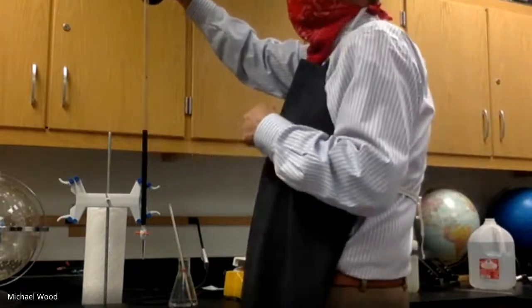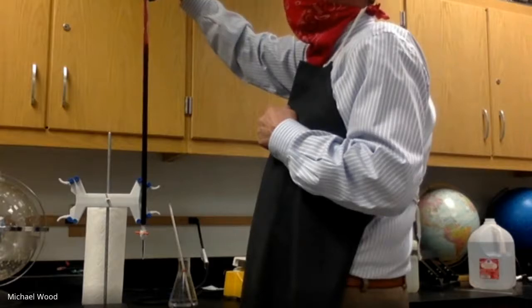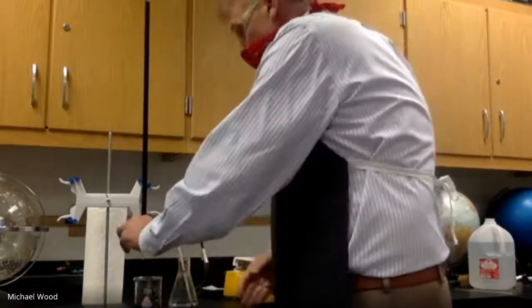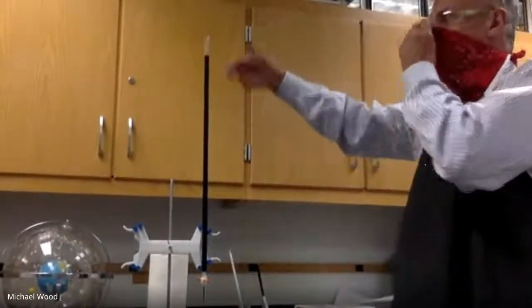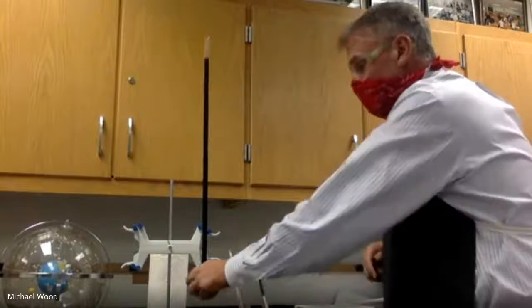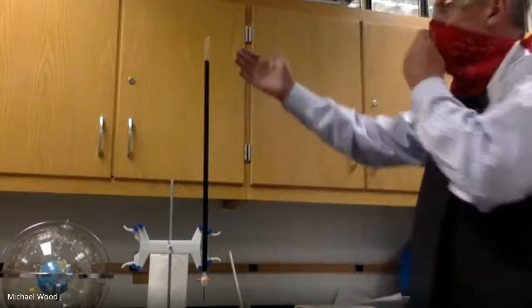And this lab is one you've got to wear, and this will be the case on Monday, Tuesday, your goggles and an apron. This stuff is kind of messy. But I actually go above the top level. If you read the procedure here, I've already done this, and I'll help you guys with this on Monday. But Monday, Tuesday, we need to clean this out. I'll get some distilled water and we'll just clean this out. With this little thing called a stopcock, I can just run some of the liquid out of here.